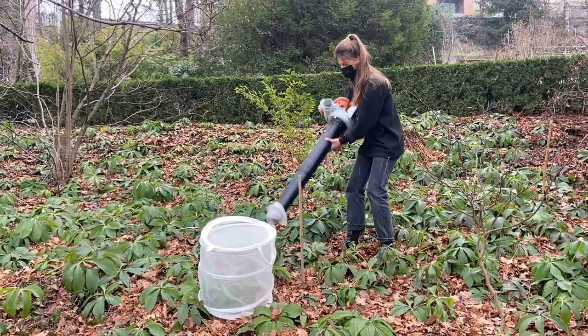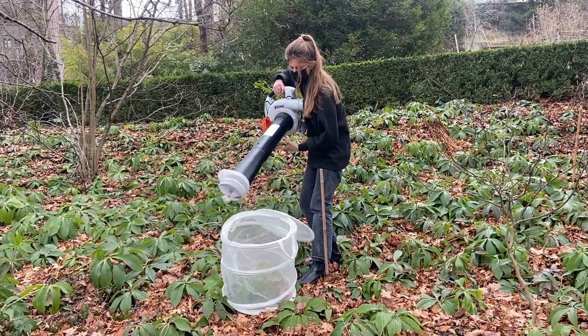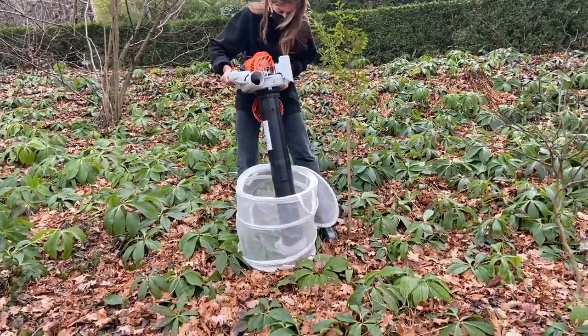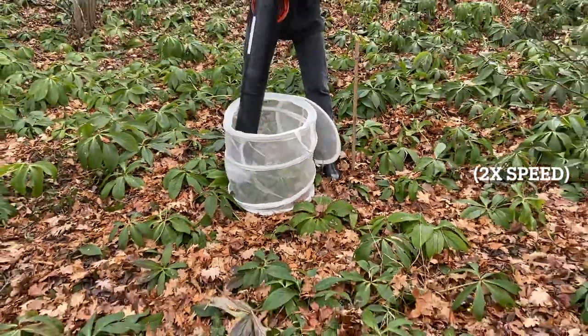Turn the leaf blower on to suction mode. Open the laundry basket and begin to suction around the plants and the litter in the net. Suction for approximately 30 seconds to 1 minute, or until you feel that you have suctioned all the invertebrates out of the laundry basket area.